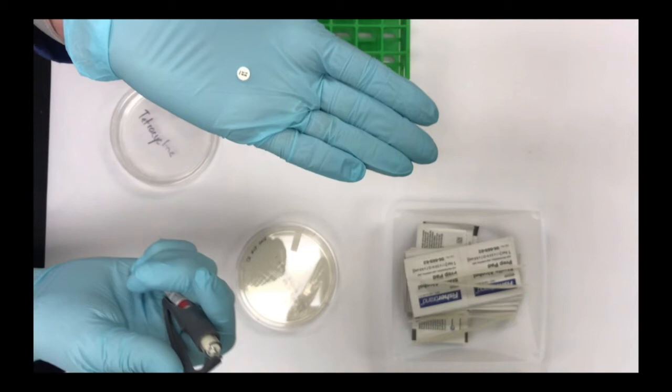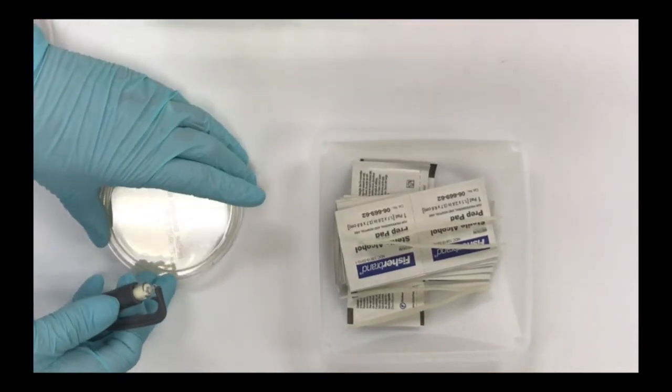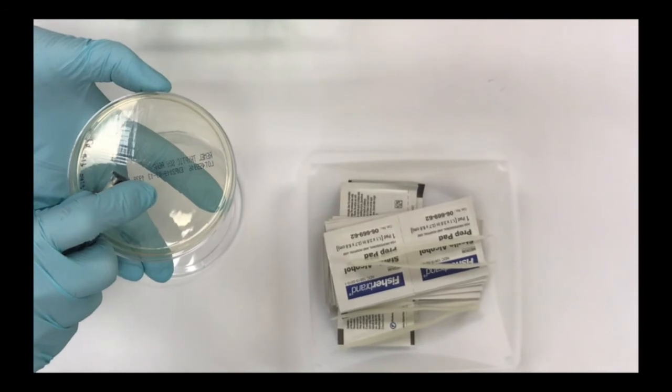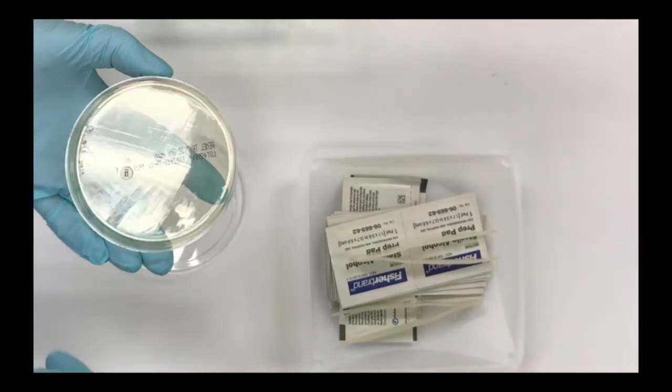Now you don't want to put it on your hand. That would defeat the purpose. It would be contaminated. So instead, you're going to do that same process, but on the agar plate with your confluent lawn. So very gently, right there, and there it goes.